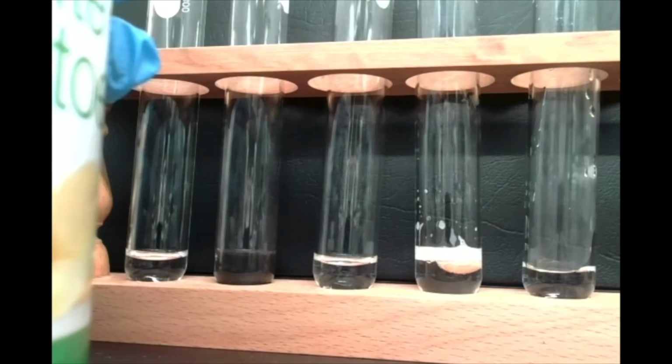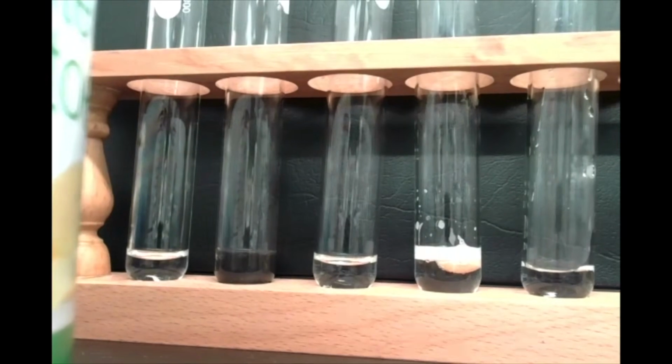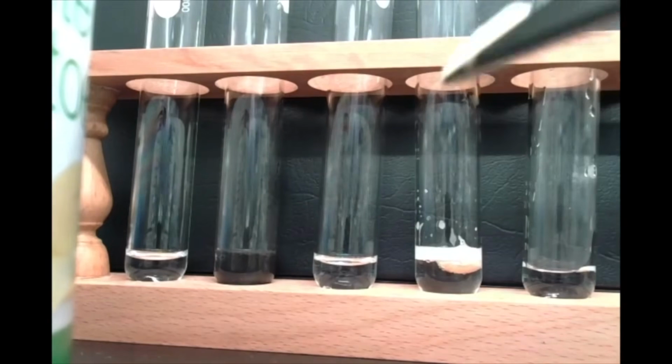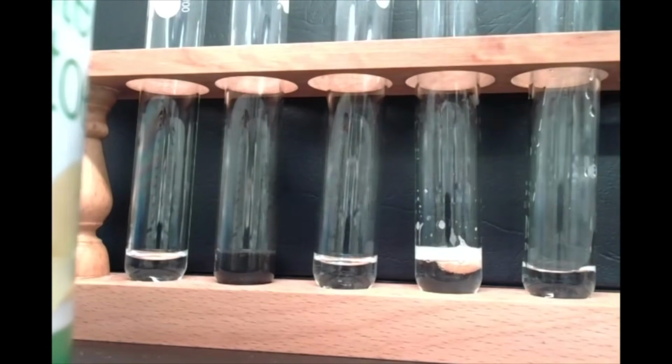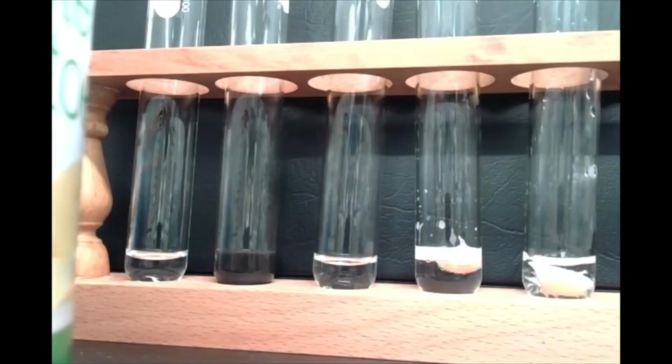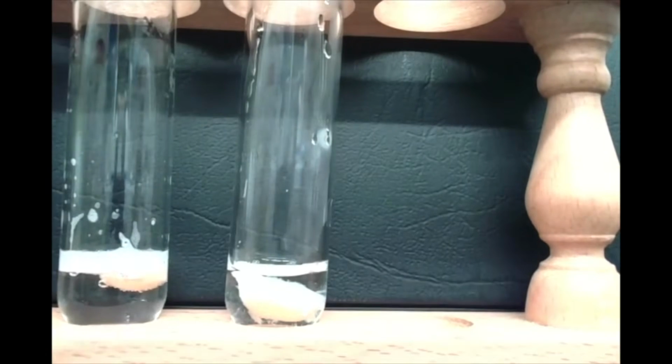I don't want to use the same one I used for the potato in case any of the fresh enzymes on our fresh potato get in here onto our boiled potato. So here's just the boiled potato added to our hydrogen peroxide there. Okay. And I'll get a close-up of that for you guys to observe.